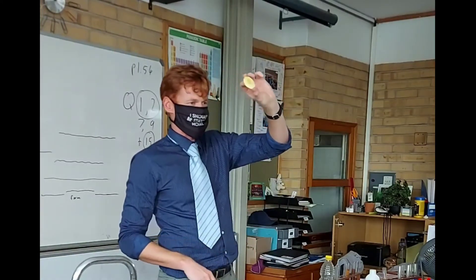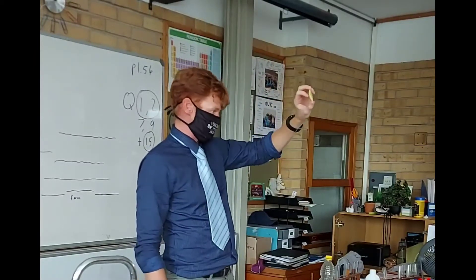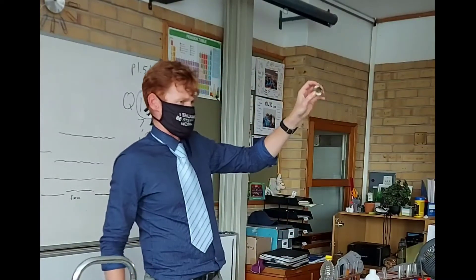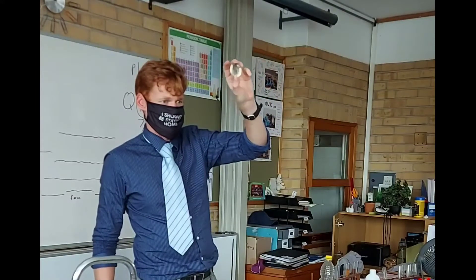Here's the apple — there's no starch in the apple because it stays a brown color. I don't know if the people in the back can see that clearly. And here is the potato — the potato also turns a dark blue-black color.